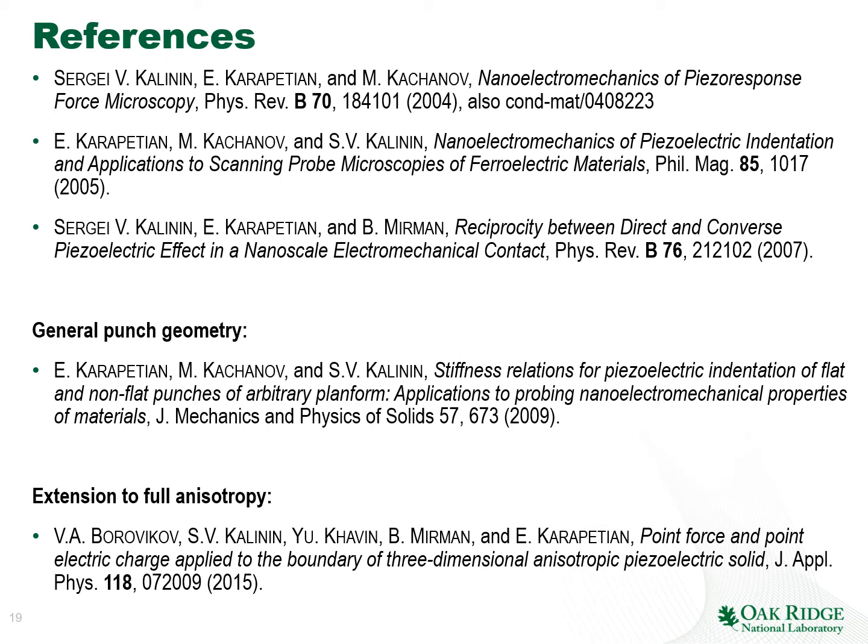The theory of the electromechanical signal in the PFM is discussed in the following set of papers, which explore the nanoelectromechanics of PFM and the reciprocity between the forward and converse PFM effect.